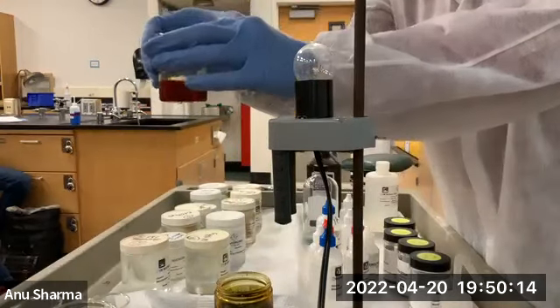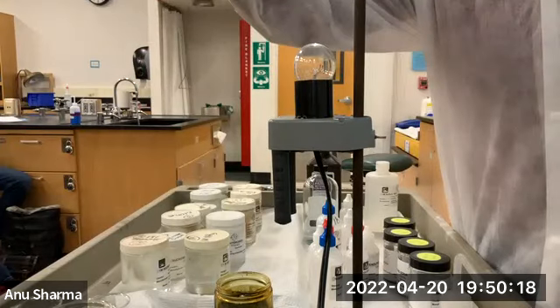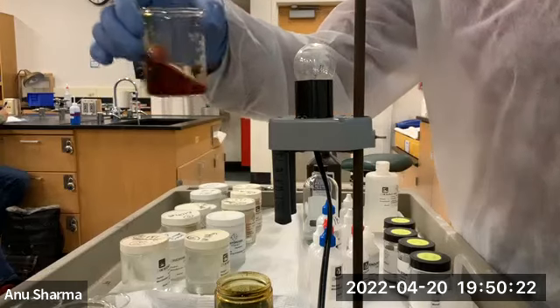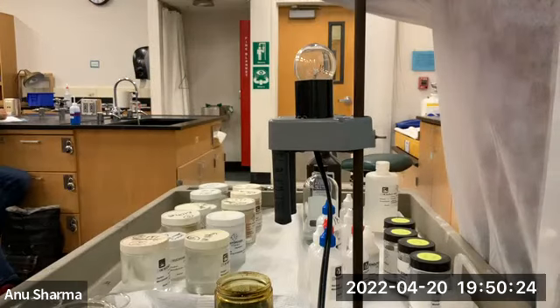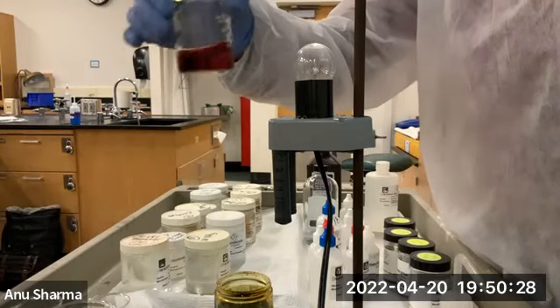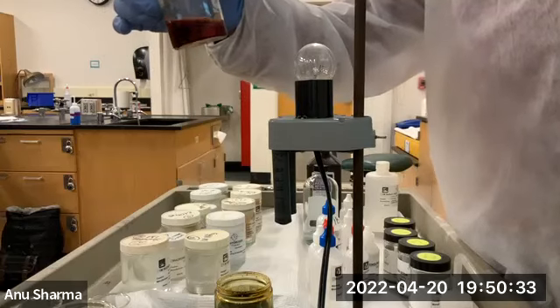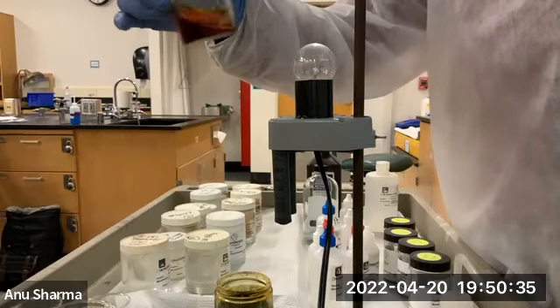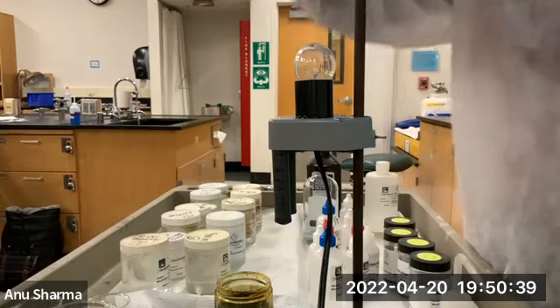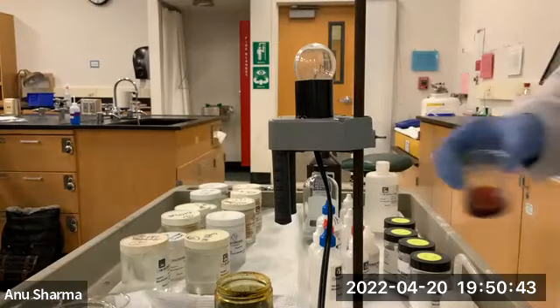Looks like this. Soluble. It's interesting because iodine is non-polar. I don't know what it is mixed in or what's happening here, but it is soluble in water, and water is polar, the iodine is non-polar. So I think if iodine is in a solid form, then it won't dissolve in water, but this is something, I don't know what, that is soluble in water, okay?